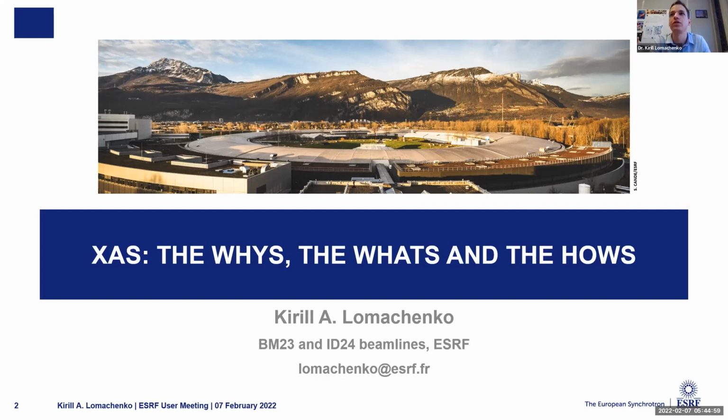You will need to plan something like 1 hour per spectrum, and you can adjust your experimental program accordingly. So it's a general answer. It's harder to be more precise, but the general rule is like this.